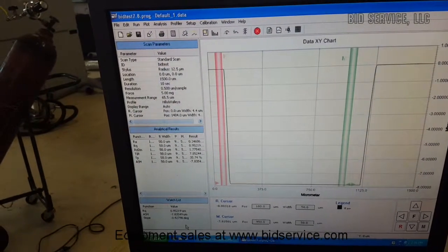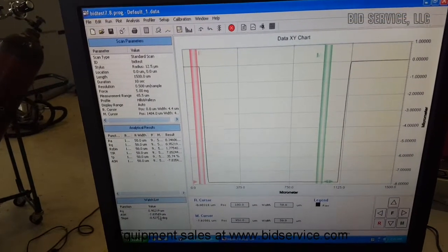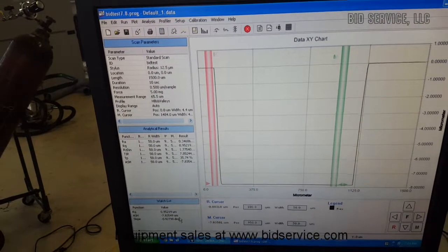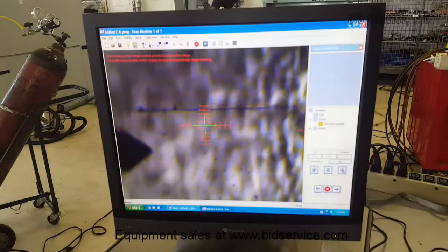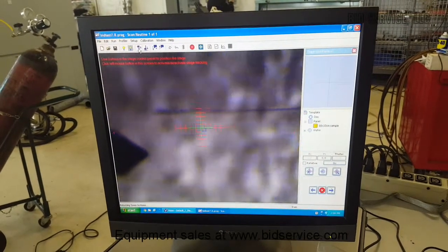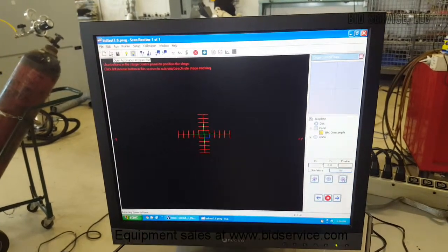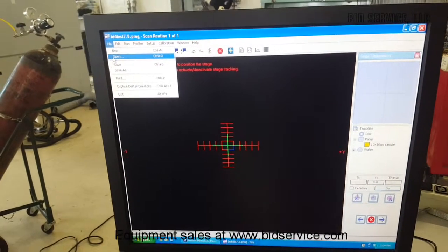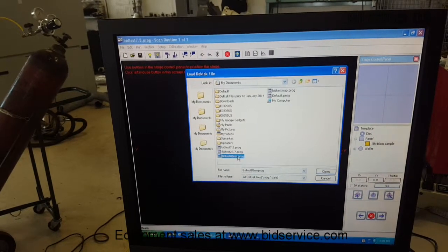And the sample that we are measuring is negative 7.858, and we're at 835, so it's measuring within spec. So we'll go back to the video screen. We'll raise the head up. And then we'll go pick the other programs I've set up. So we'll do the 88 nanometer next.